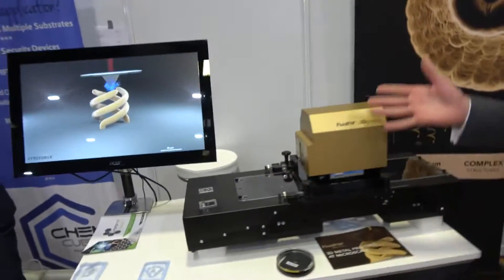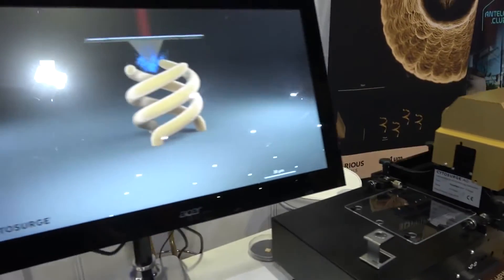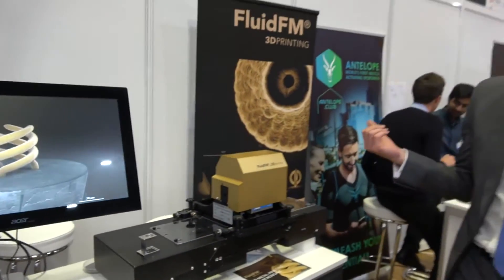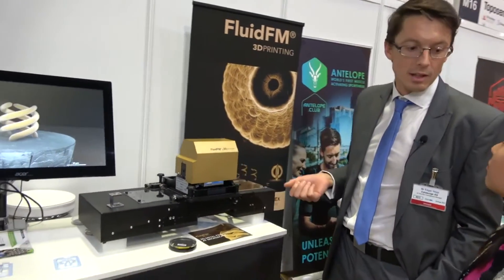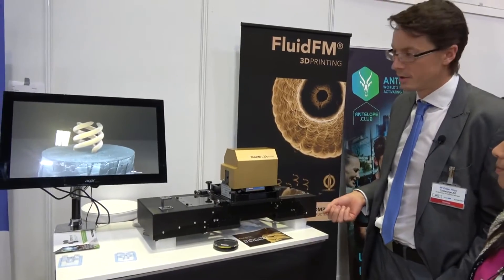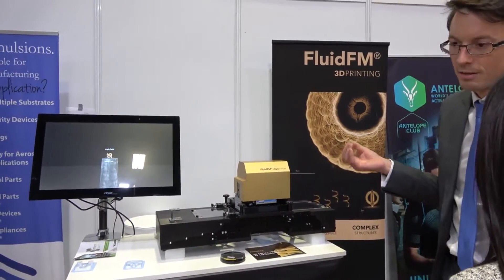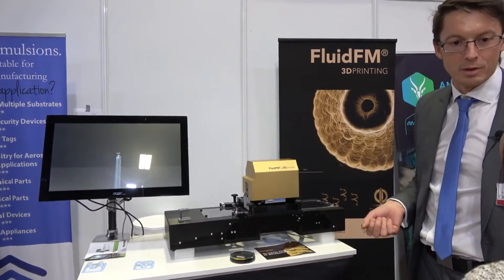Basically, we have here our Fluid FM Micro 3D printer. This is the printer which can print metal objects out of a solution at room temperature, in the size of micro objects — like one micrometer diameter, for example, or even smaller or bigger.